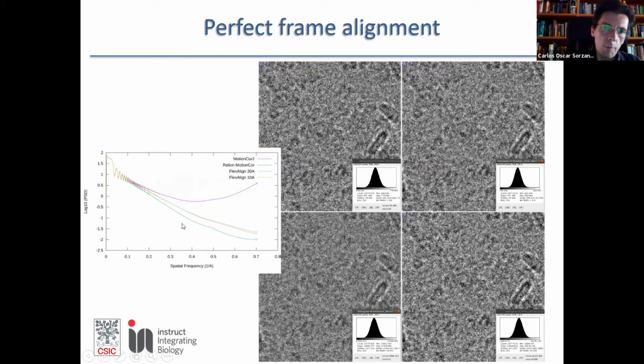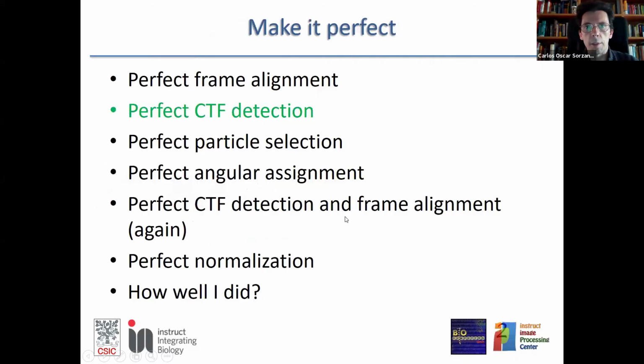And you tend to believe one of these more than this one. It is not a criticism of MotionCor2 applied to anything. Only that, again, for every specific case you need to compare the output of several algorithms to be sure that what you are saying is the right thing. And these things have their impact in terms of histograms, in terms of the local properties of the gray values and so on.